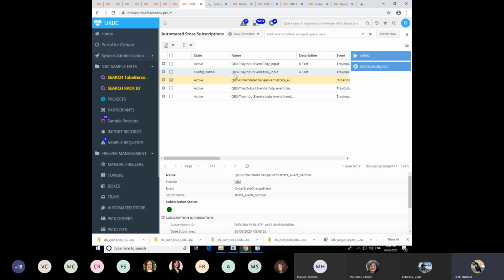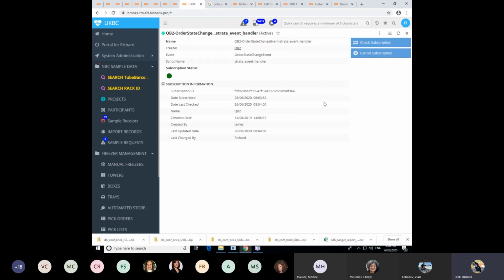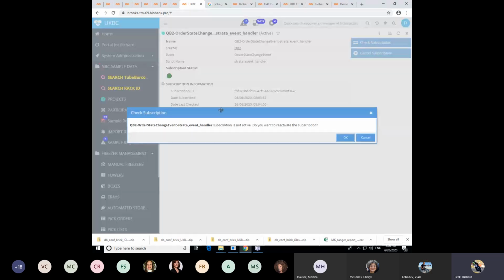Now, the other thing that Vlad mentioned was we were taking this over from another LIMS. And one of the issues that we had with the previous LIMS was that the subscriptions would go stale. By this I mean if something happened within the store and it tried to post notifications a number of times and it didn't get a response, it would actually drop the subscription. But in the previous LIMS, this wasn't reflected, so you would log in and it would show as an active subscription. So what we've been able to do with Biobank Pro is we can come in and actually check the subscription in real time. So if we check the subscription here, it will check and say that the subscription isn't actually active.